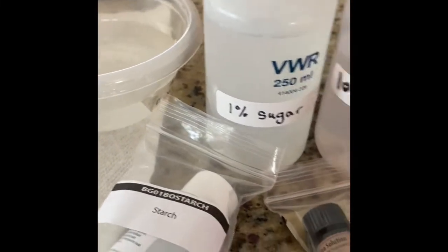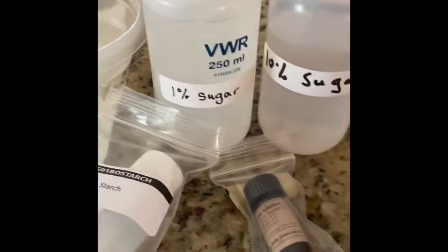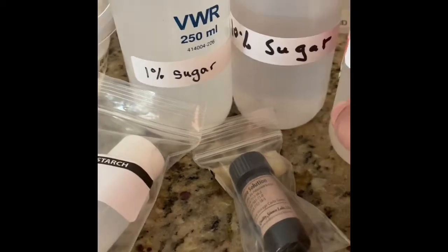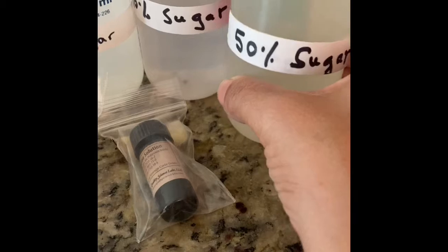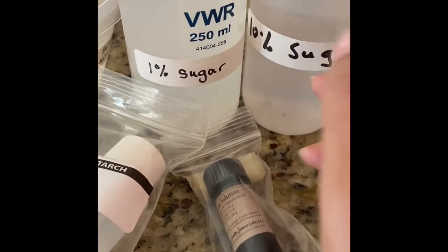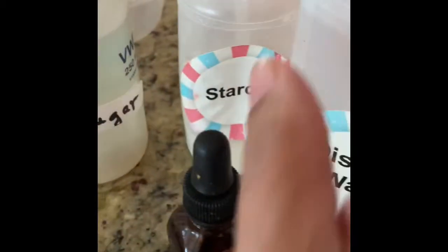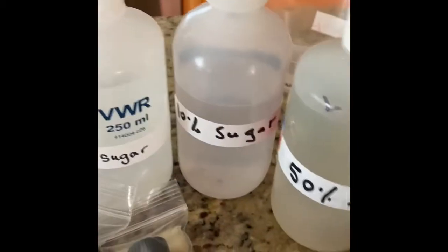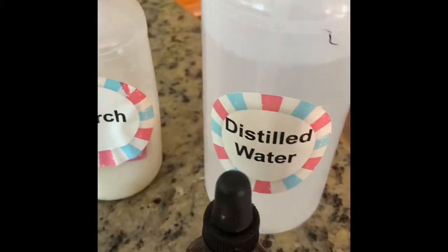And this is where I have my solutions: 1%, 10% sugar, and also 50%, which is a little concentrated. 1%, as I said, is 1 gram for 100 milliliters of water, 10% is 10 grams for 100 milliliters. And of course we need just water. We need a starch solution, and we can have it also.